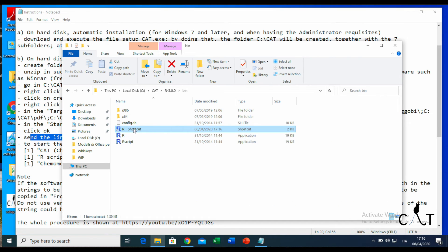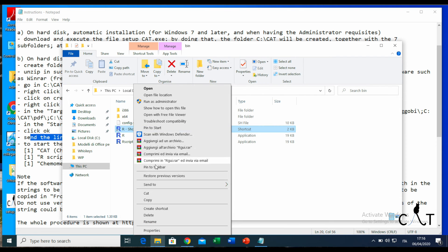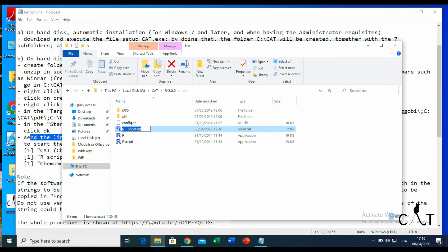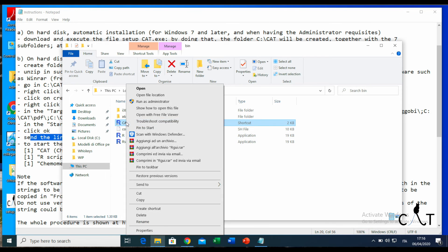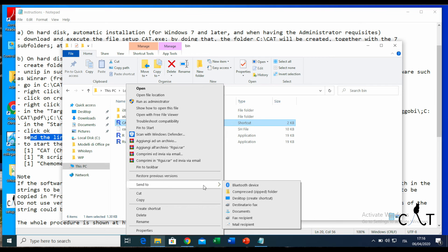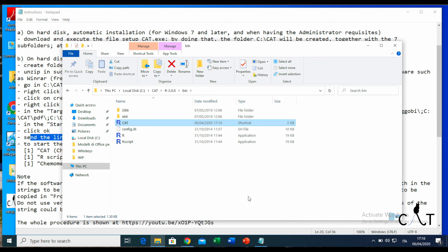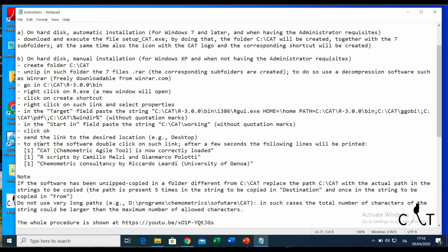What we want to do is send the link to the desired location—the desktop. Right-click and rename it first. So we call it CAT. And we send it to the desktop to create a shortcut.